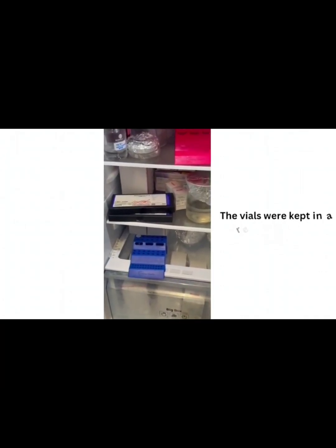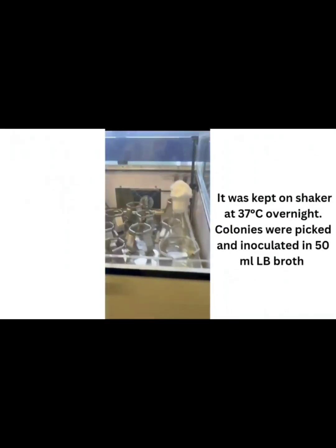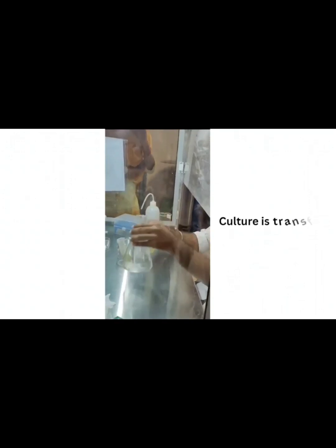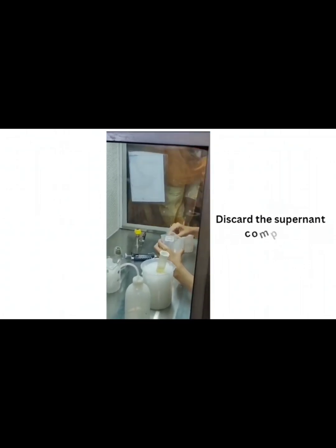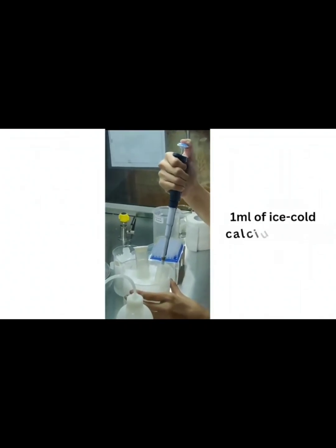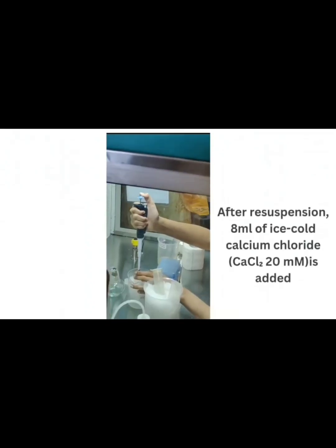Keep the LB broth containing the colony flask on the shaker incubator at 37 degrees Celsius overnight. The culture is transferred equally into 2 tubes and centrifuged at 6000 rpm for 10 minutes at 4 degrees Celsius. Discard the supernatant, add 1 ml of ice-cold solution of calcium chloride to the tubes. After that, resuspend it with 8 ml of calcium chloride solution. Place the tubes on ice for 20 minutes.